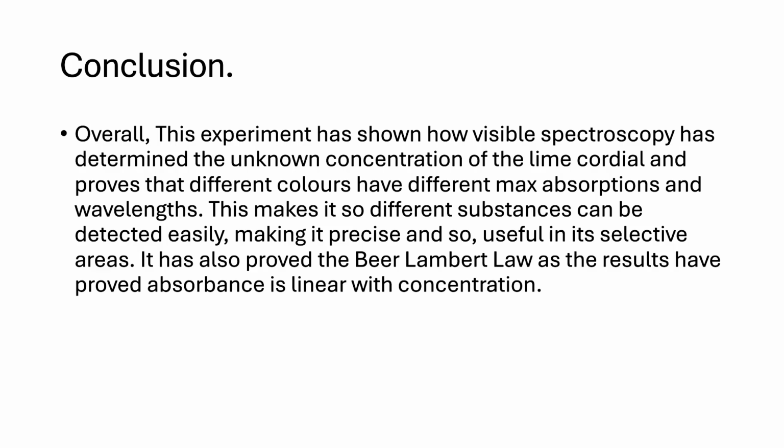And so different substances can be detected easily, and due to it being precise, it is used in certain areas and industries. And this experiment has also proved the Beer-Lambert law, and so has proved that the absorbance is linear with the concentration.